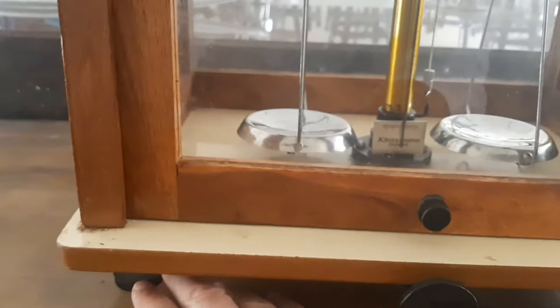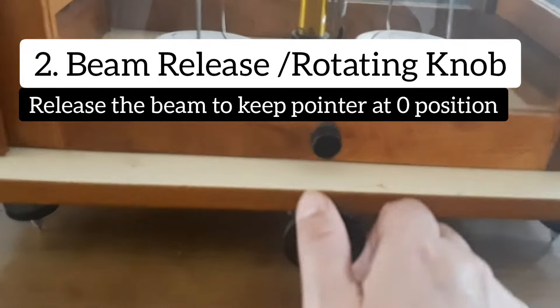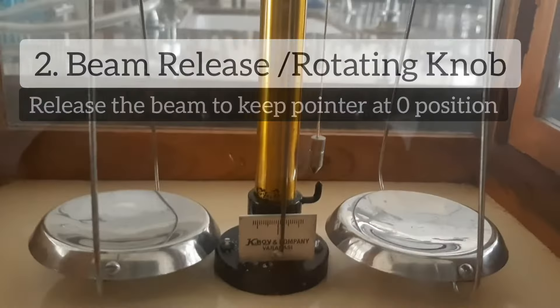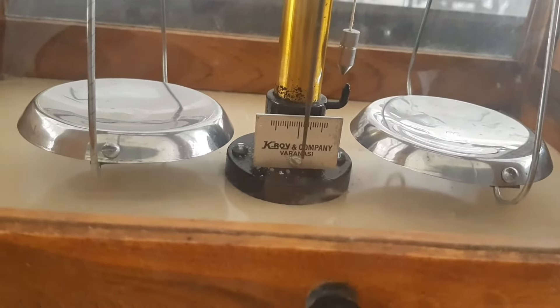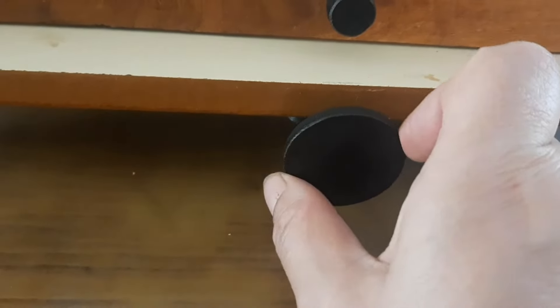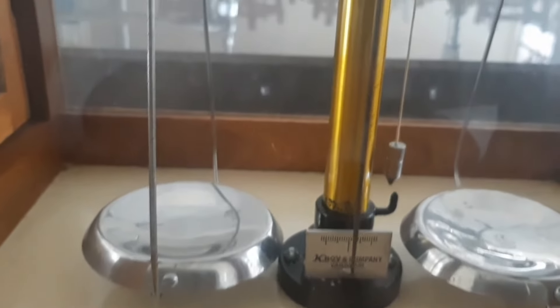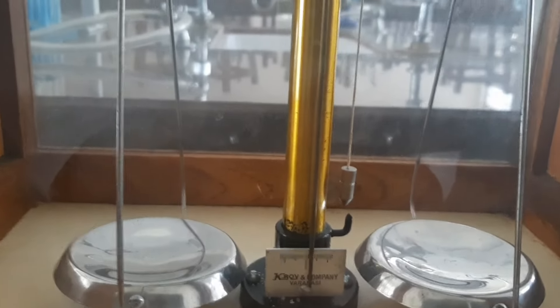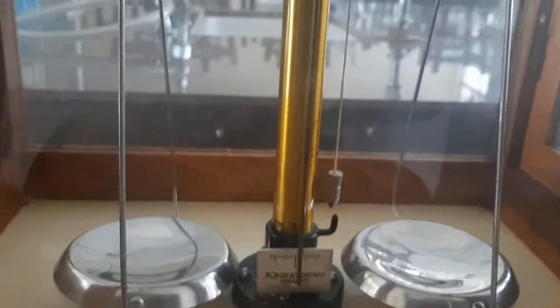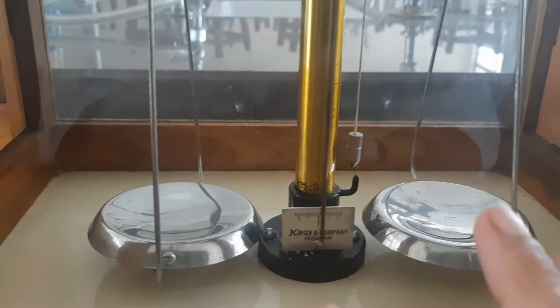We have a screw here and a screw here, and this is the main knob. When moved, you can see this pointer is going to move either towards left or towards right. When I move this rotating knob in the clockwise direction, the pointer also moves right. Before we begin, it's important to adjust this to zero value, which means when the entire analytical balance is balanced.